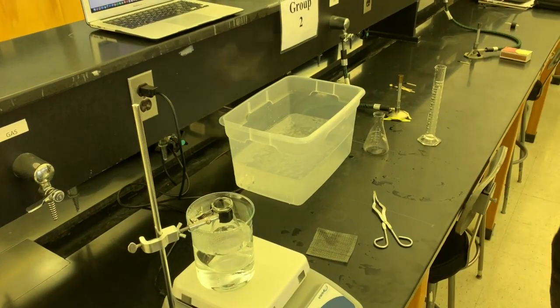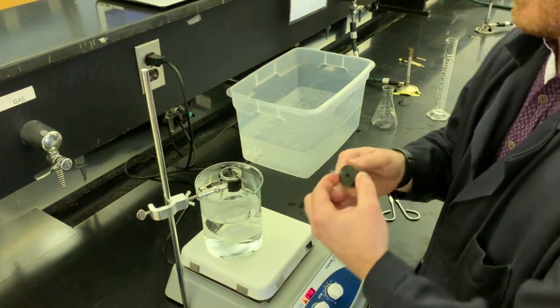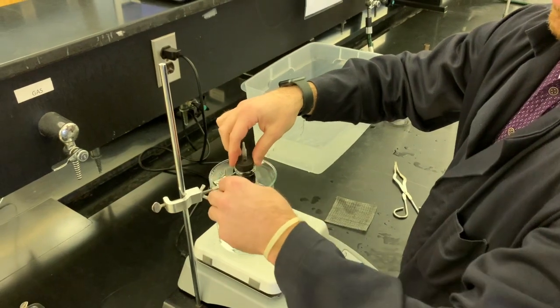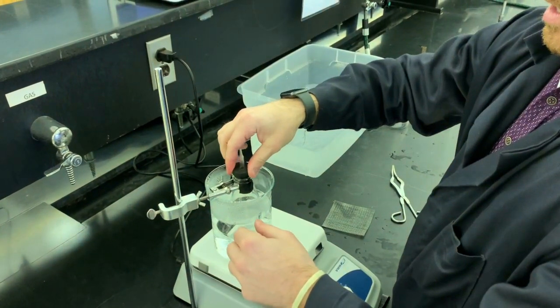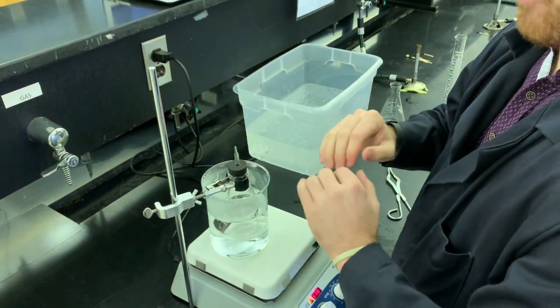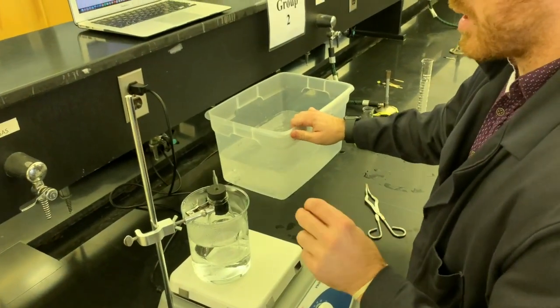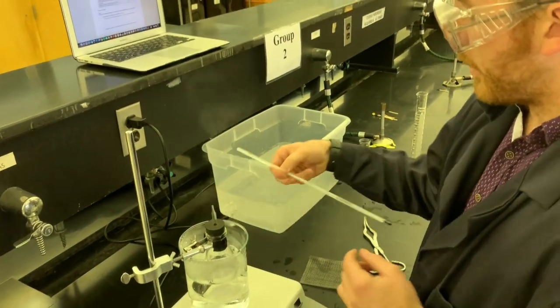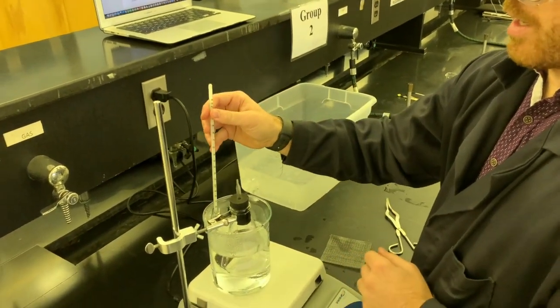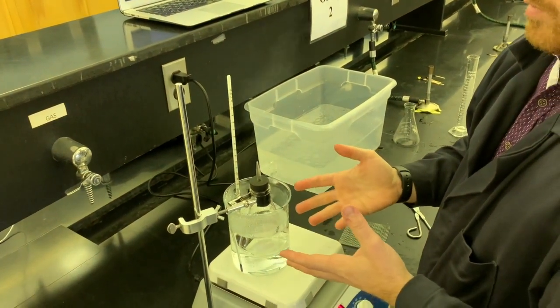So with that, you're also going to put in the stopper with a little piece of pipette, and that's going to prevent moisture from getting in, but also it's going to keep basically the water from entering the flask very quickly once you put it into the ice bath, which we've also set up ahead of time. Finally, we're going to take this thermometer and place it inside of the water bath in order to get an idea of what temperature we're working with.